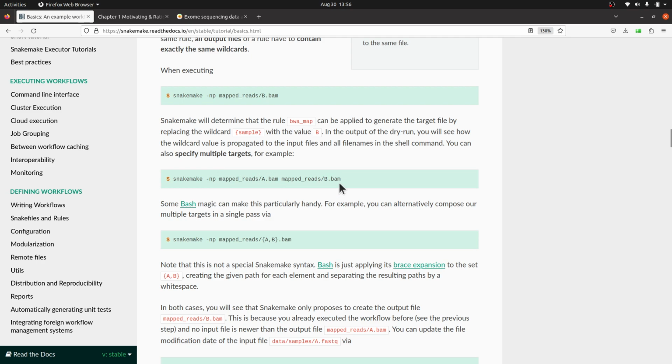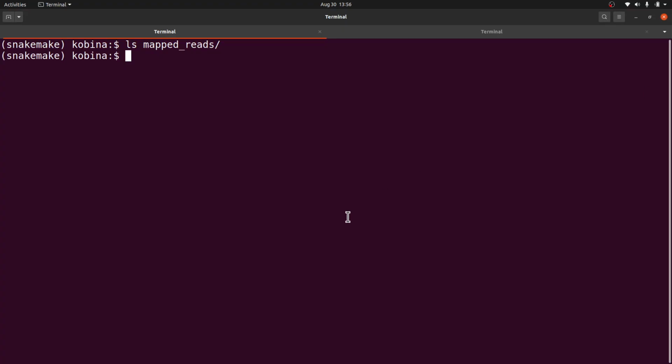Here we specify two of them, let's say father and then mother. We can do that here as well. That means we have to specify the outputs, and then Snakemake will automatically get the inputs. So we can say snakemake -j 1, then -p, and -s snakefile2 because we are still using that one.